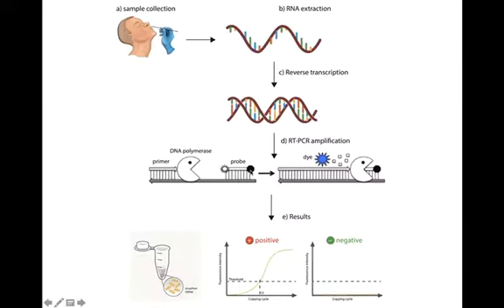So the probe is then hydrolyzed, and after hydrolysis of the probe, the reporter dye emits a specific fluorophore radiation. So if the virus is there inside the sample, obviously the probe will bind over the target because the probe is a specific DNA fragment, DNA molecule which has complementarity with the target.